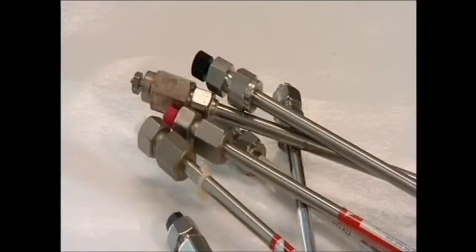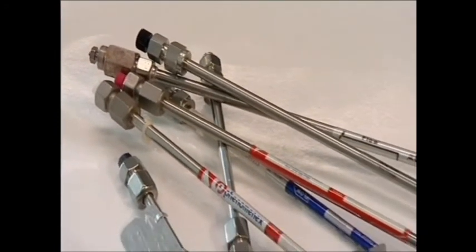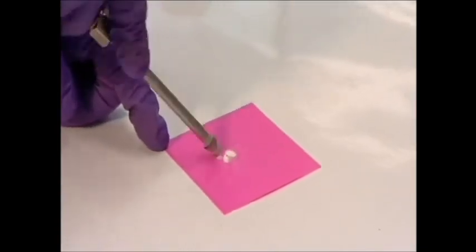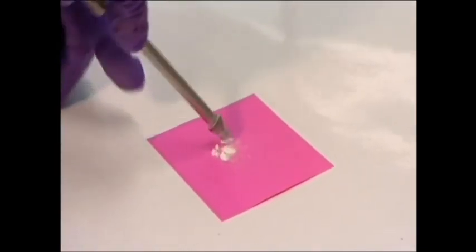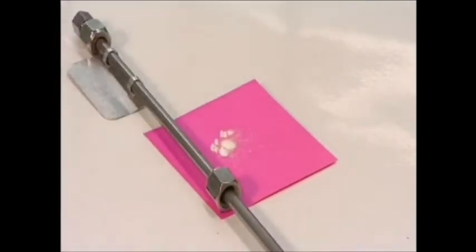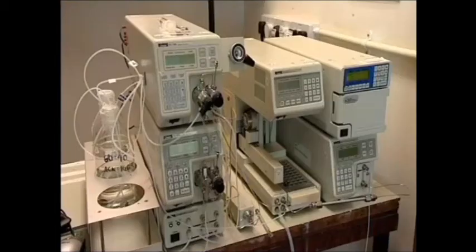In HPLC, the stationary phase is a solid packed into a column, like one of these. This particular column contains silica particles to which C8 hydrocarbons are attached, making the stationary phase nonpolar. In HPLC, the liquid is forced through the column by high-pressure pumps. The whole apparatus looks like this.